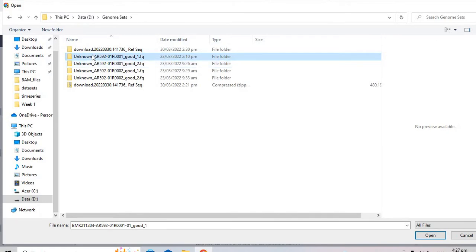First, in sequencing there is unidirectional sequencing and paired end sequencing. With my data, I have paired end sequencing. That means for a certain fragment, the read is from forward and reverse.